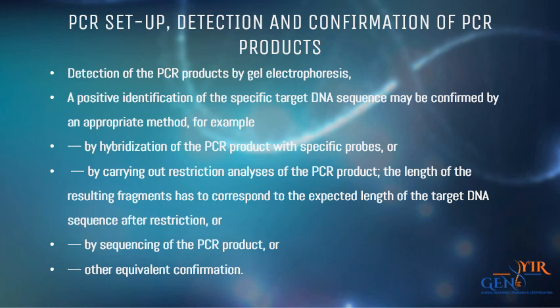Example, the 35S promoter is derived from cauliflower mosaic virus, and consequently detection of the CaMV 35S promoter could be due to the presence of either GMO-derived or CaMV-derived DNA. By checking for presence of other CaMV-derived DNA, it may be possible to confirm the GMO origin of the CaMV 35S promoter if no other CaMV-derived DNA is detected.